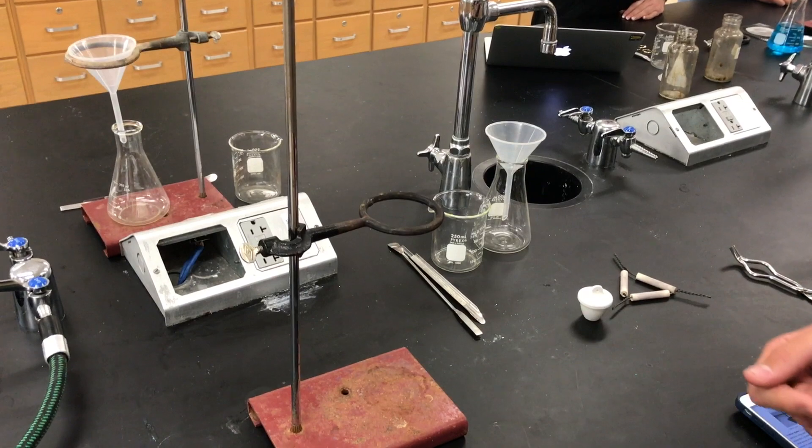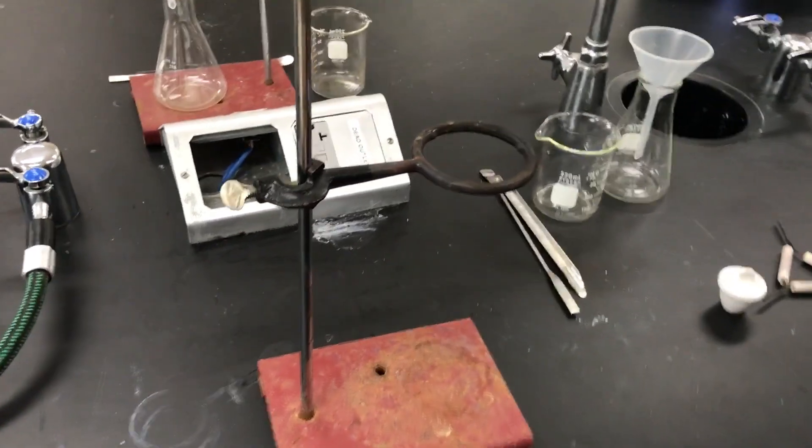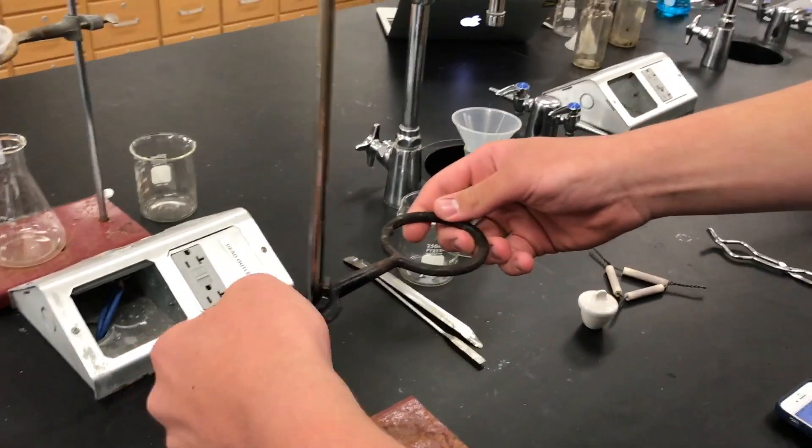This is a ring stand. It is used in chemistry to hold other things. You can move it up and down to adjust so you have a really large flame.